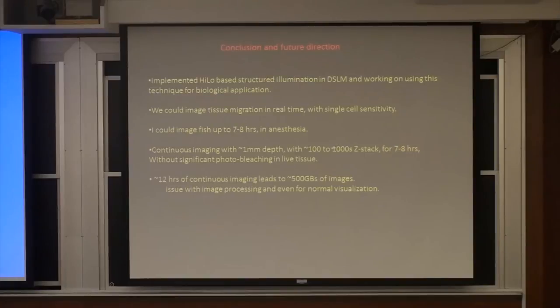And with 100 to 1,000 z stacks, because photo bleaching is very low, for several hours without significant photo bleaching is a big advantage in this kind of case. And this kind of imaging can generate a lot of data, and ultimately one has to do the image processing and segmentation to get information out.